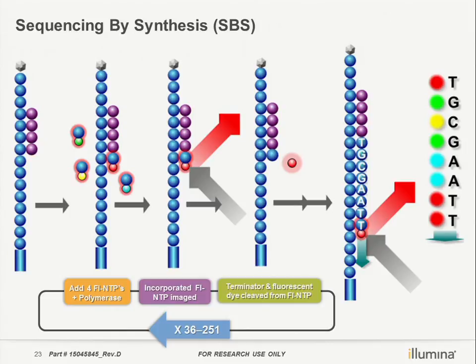So what is the read length? How long are you going to sequence? It's talking about how many cycles, or how many base pairs, you are going to incorporate into your sequencing. Each fluorophore will give a different wavelength, and then we'll have the image captured, and the real-time analysis software incorporated in the instrument will call the bases. We'll have a detailed description of the primary data analysis tomorrow morning.